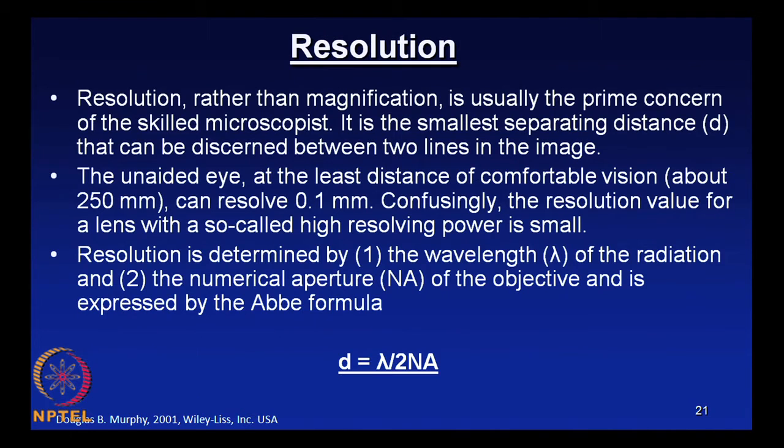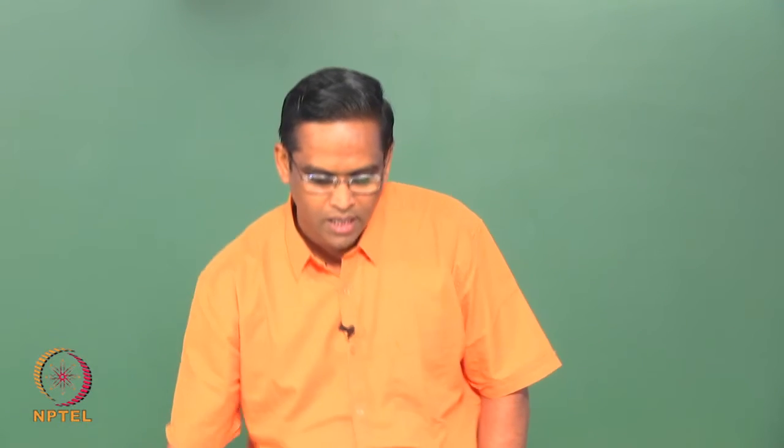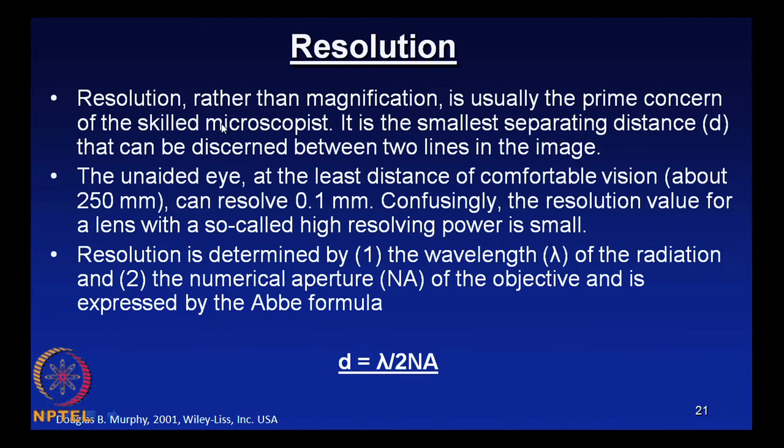Now we will concentrate on what resolution is. Let us look at the introductory remarks. Resolution rather than magnification is usually the prime concern of a skilled microscopist. It is the smallest separating distance D that can be discerned between two lines in the image. So you have to be very careful. You should not confuse resolution with magnification.